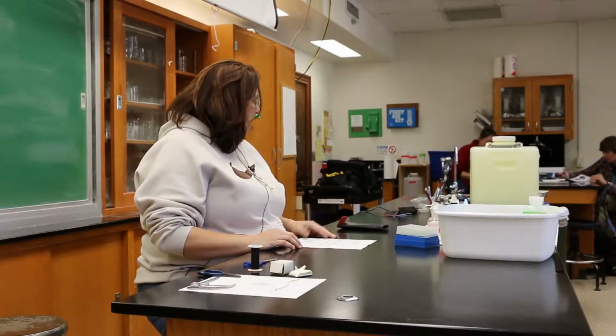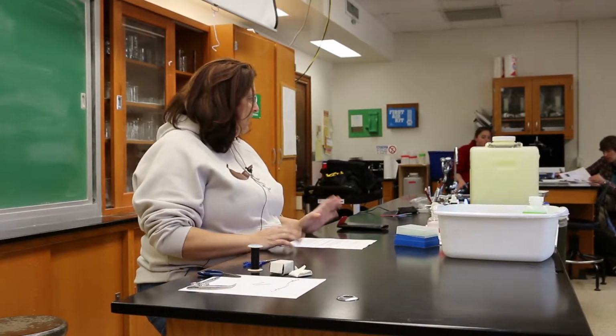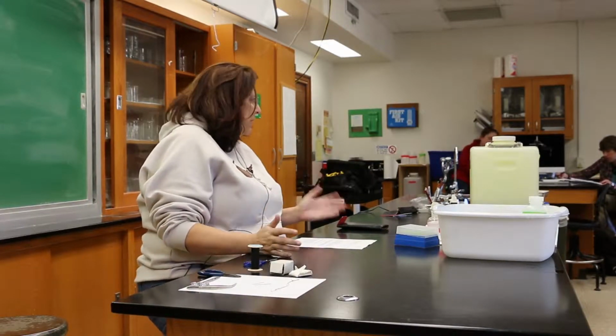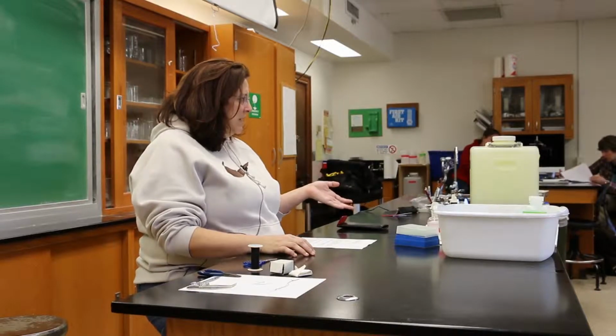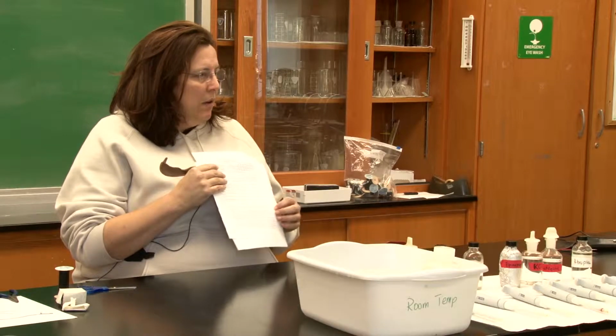On Wednesday morning, the acetylcholine and the epinephrine will need to be remade. They just don't last very long because they're neurotransmitters. Epinephrine oxidizes, acetylcholine just stops working. I have included the recipes for how to make the solutions in the first page of the TA guide. Okay, so make sure that you are familiar with those.